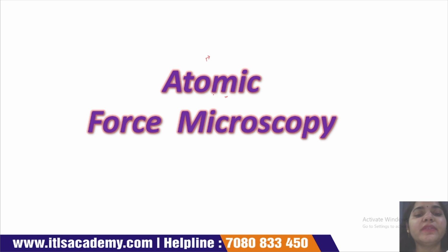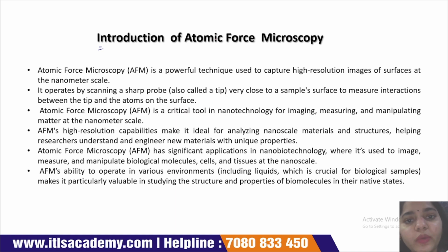In today's lecture we will discuss atomic force microscopy. This atomic force microscopy plays a most important role in the field of nanobiotechnology. Now we start today's lecture. What is atomic force microscopy?